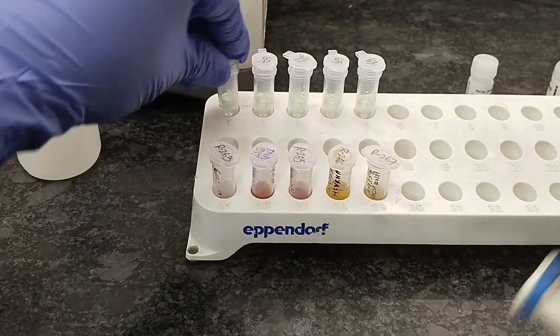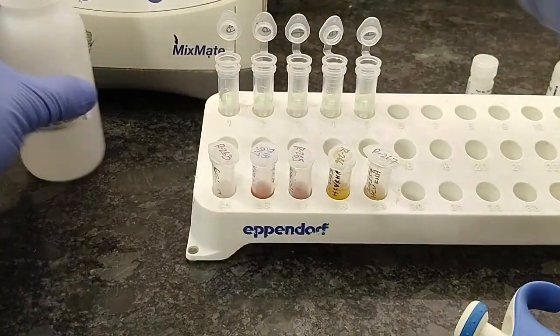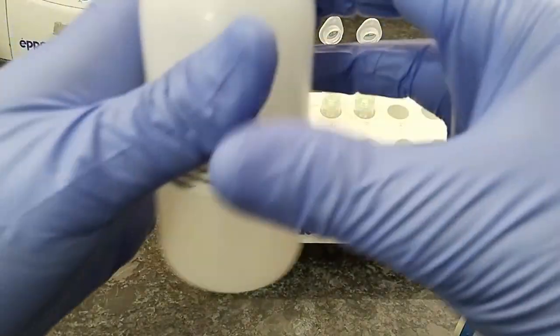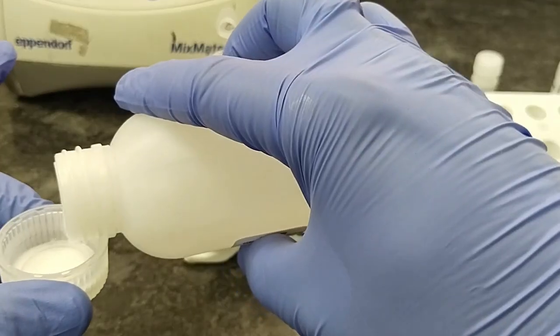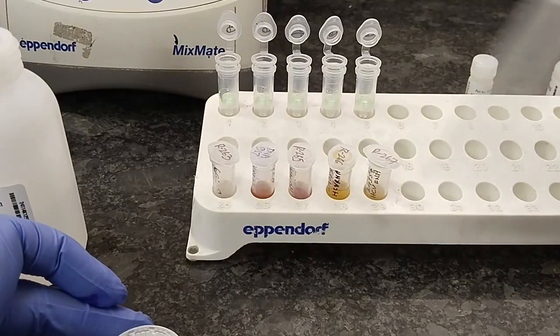So open the lid of the binding column and then add membrane wash buffer, 600 microliter, in each tube.